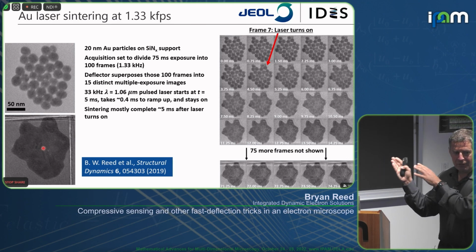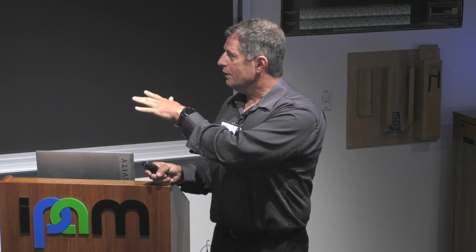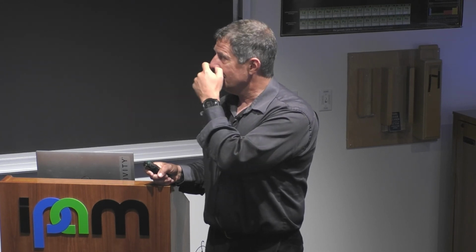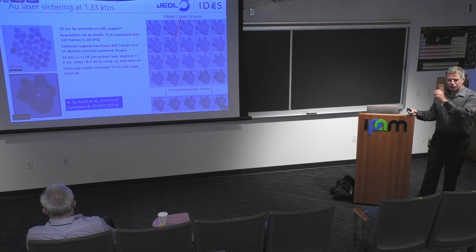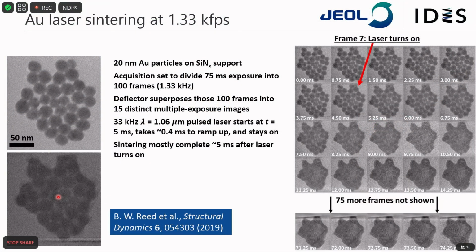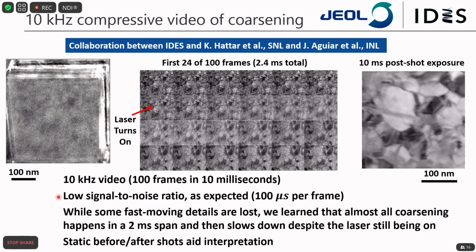This is the process that's involved in a lot of pulse laser 3D printing. And we're here watching it in detail on the multi-millisecond scale, multi-microsecond scale, really. And we're doing it on a camera that can't even take 1 frame per second, just because we've compressively put all of this data into one camera frame. So how far can we go with this thing?